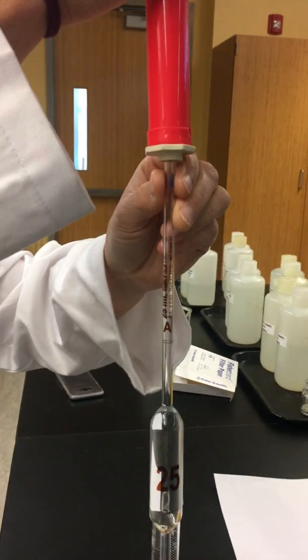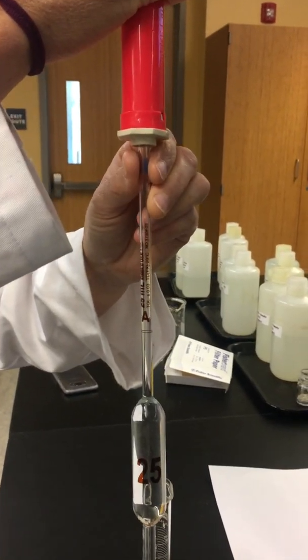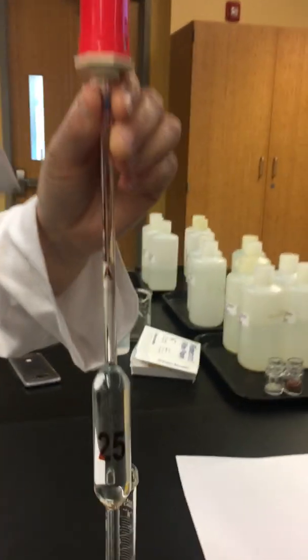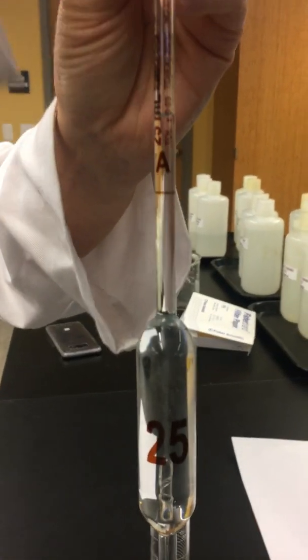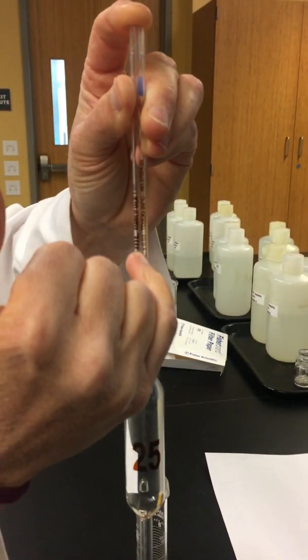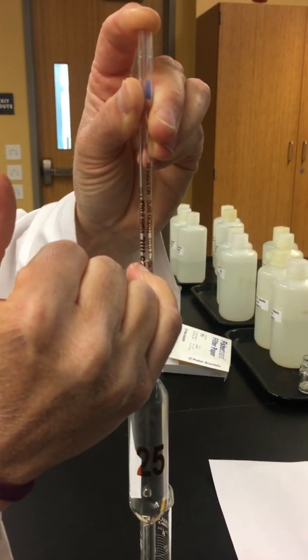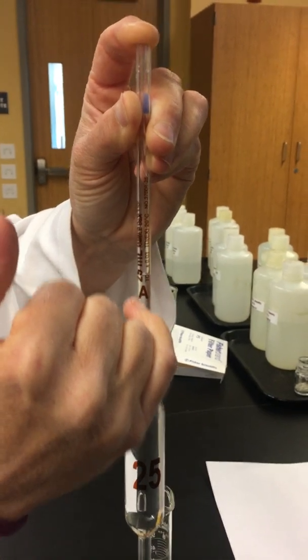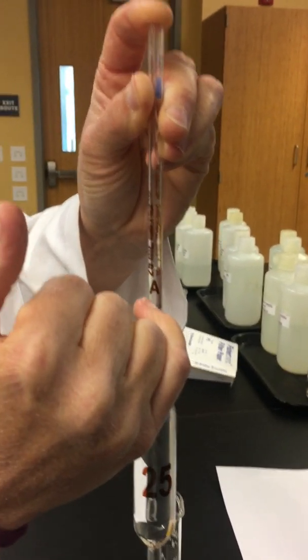And then what we're going to do is allow it to come down to that final volume. So I'll pull it up above, then we take our finger and place it on top. Now we want to allow our liquid to flow out until we get the bottom of the meniscus right on that line.